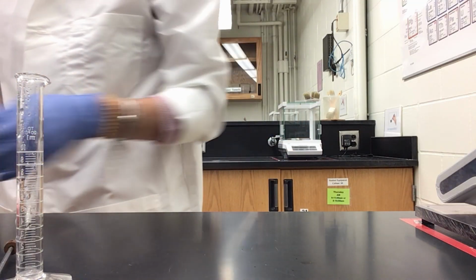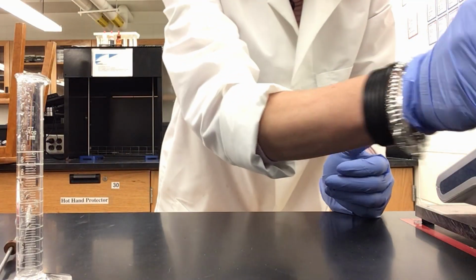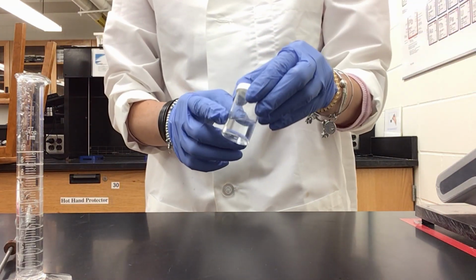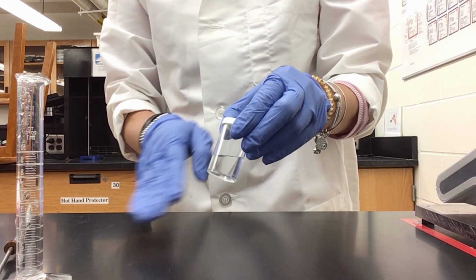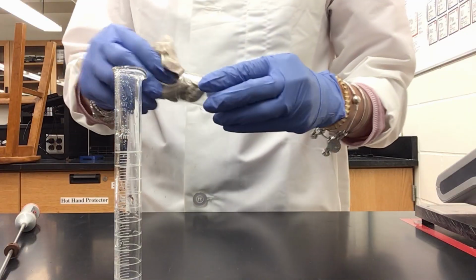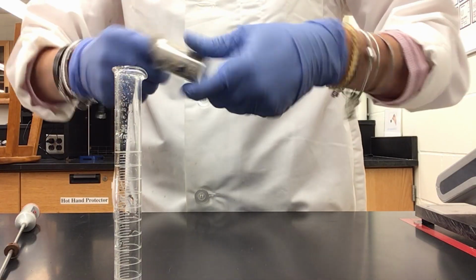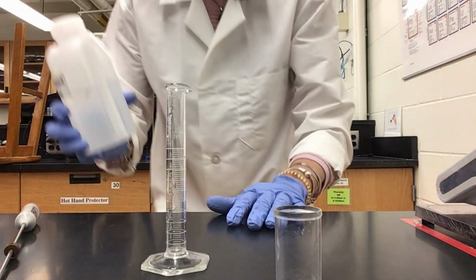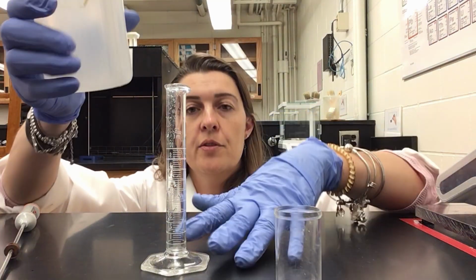Okay? And again, I will take my water, I will dispose of it, I will dry it, and measure it again. So now I'm gonna dry it again. Now it's dry, and I can measure again 10 milliliters.